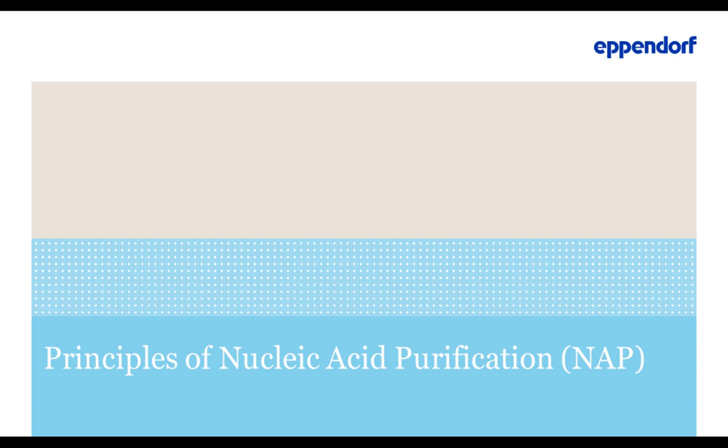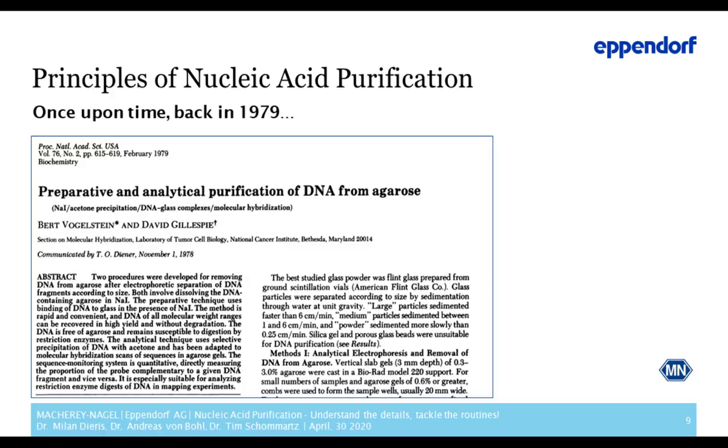It is important to have this background knowledge because you will often run into problems regarding your sample lysis, regarding the purity. And most of the time, if you think a little bit about what is the purpose of each and every step, you're able to solve these problems yourself. And that's often much easier, much less painful to think about in advance. So I want to give you this background knowledge on the principles of nucleic acid purification.